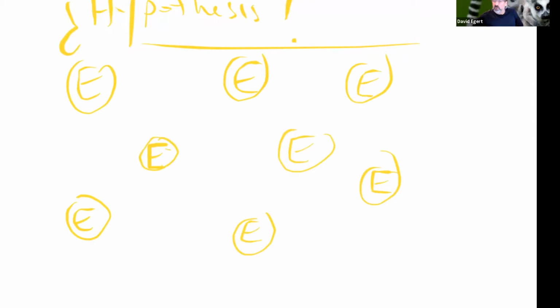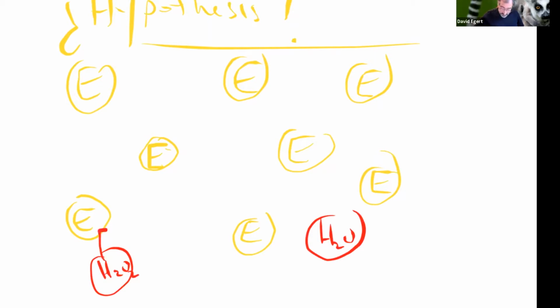And we are keeping enzyme constant, right? Every time we do a run of this experiment, we always have the exact same amount of enzyme. So enzyme is not a variable in this. Enzyme is controlled. It's always the exact same amount. And so let us think about, let's put in our H2O2. If I put in this much, whenever H2O2 hits an enzyme, it'll break apart at however fast that happens.